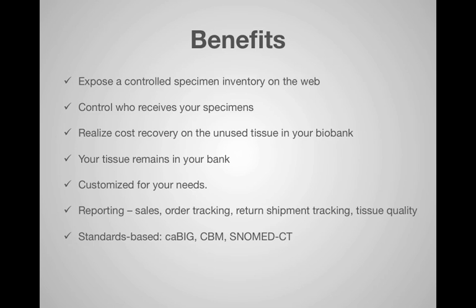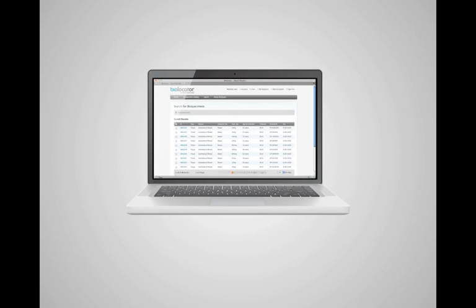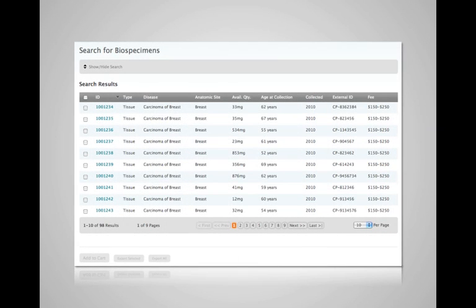Now that you know how to get data from your biobank into BioLocator, let's look at the value this integration brings. While a main benefit of BioLocator is that you can expose your inventory over the web, it's all in your control. You choose what specimens are displayed — flag or export only the ones you want to be visible on the web.